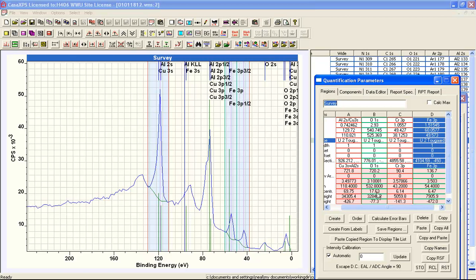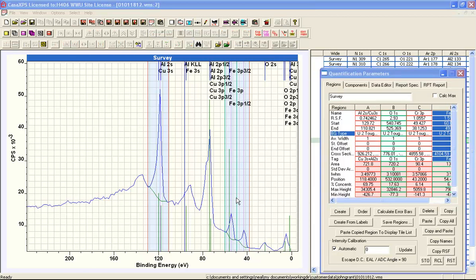The quantification reported as percent concentration is correct for these three lines, giving relative proportions based on atomic concentration for oxygen, chromium, and iron. At this point, we have a combined concentration of copper and aluminium, which will need further analysis in terms of peak decomposition using the components tagged in the high-resolution spectra.